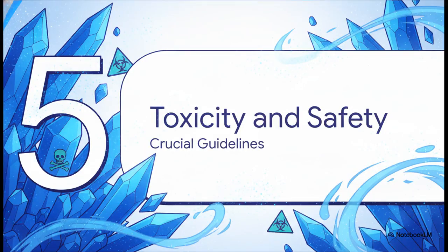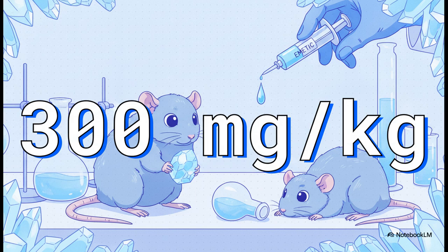Now, as beautiful as that crystal cave is, it leads us directly into our final section, Section 5, Toxicity and Safety, because we absolutely must address the serious safety precautions required when handling this visually stunning but hazardous compound. An LD50 of 300 milligrams per kilogram is the median lethal dose for rats when taken orally. While copper sulfate was actually used in the past as a medical emetic, meaning it was given to patients to intentionally induce vomiting, well, it's now considered far too toxic for that purpose by modern medical standards. So yeah, definitely don't try that at home.